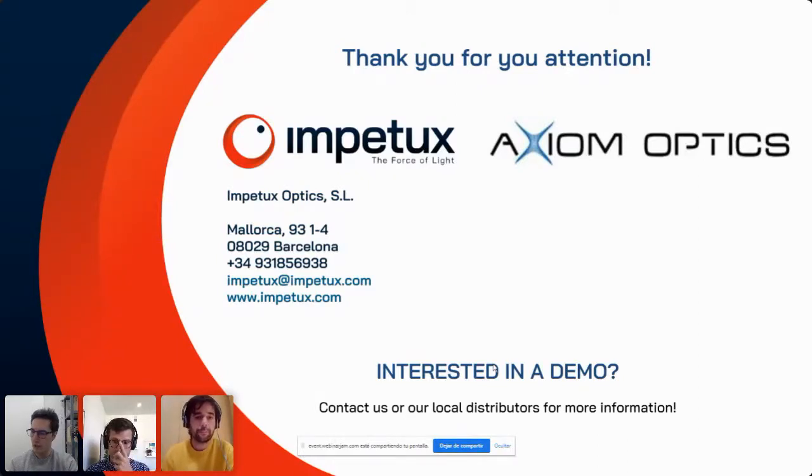So one thing I can add is that phototoxicity will also depend on the time exposure, right? Typically, when you set up the experiment, when you manipulate your objects to set up the whole experiment, you use very low powers.